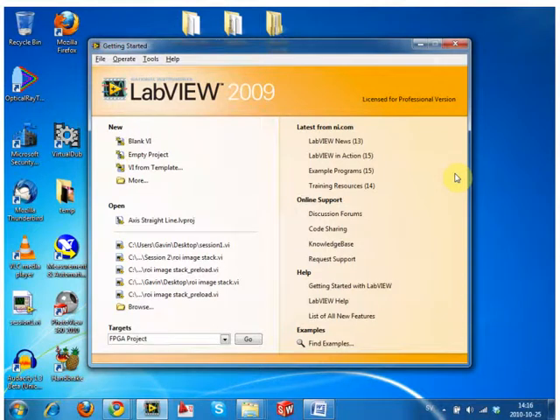Okay, so session number 2. Like I showed in the application video, we're showing how to analyze a stack of images instead of a single image. So a lot of the things will center around that.